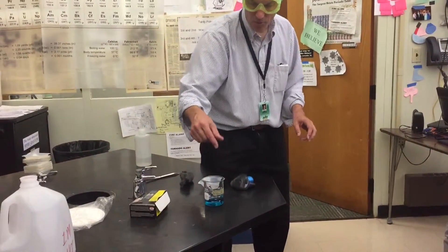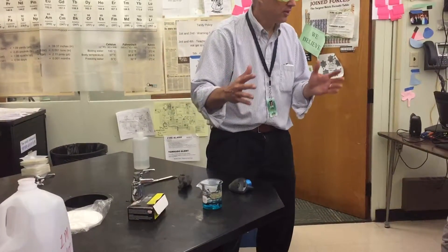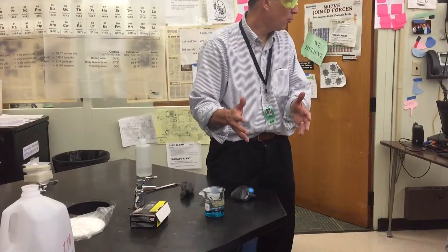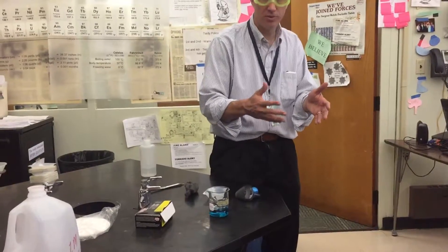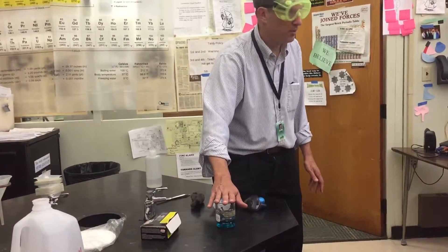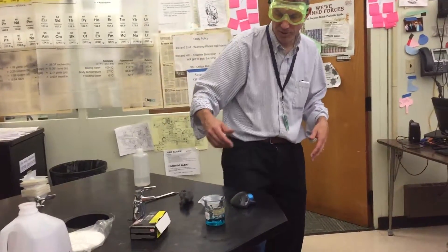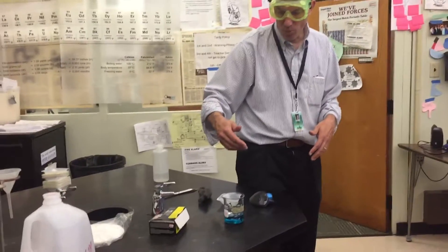Okay. So, there's a chemical reaction happening. Now, iron chloride is forming, but we don't know which iron chloride. So, typically, we would wait about 20 minutes. Okay, so now, because we don't want to wait that long while we're doing this, I'm going to show you what we'll do from here.